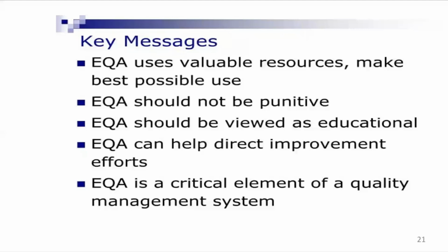It is some sort of educational activity, and it is improvement in the laboratory activity. A very important component of the quality management system.